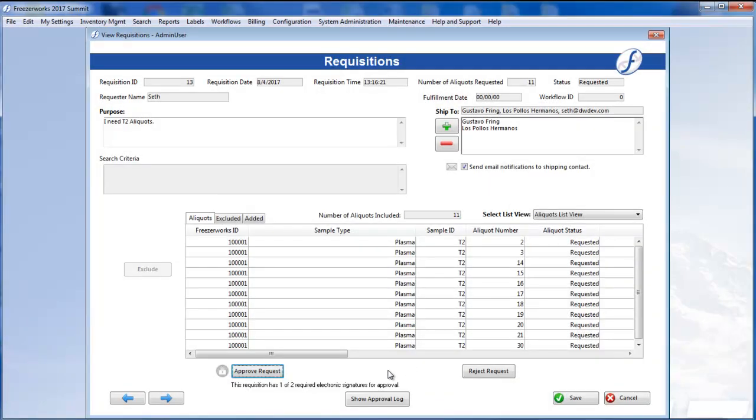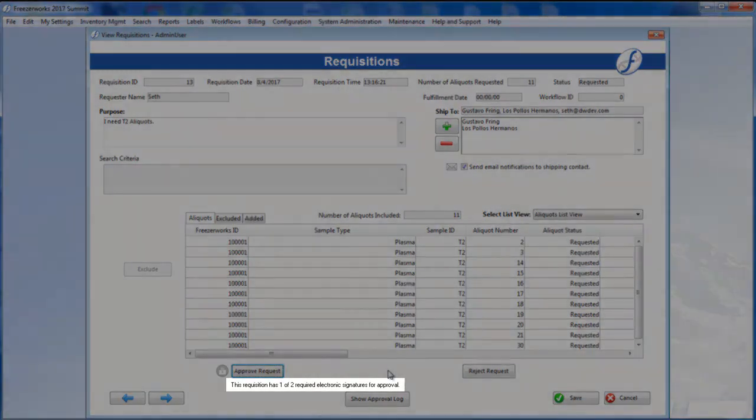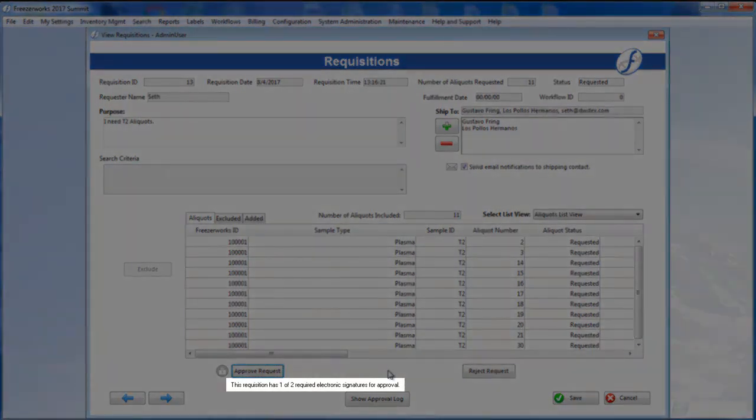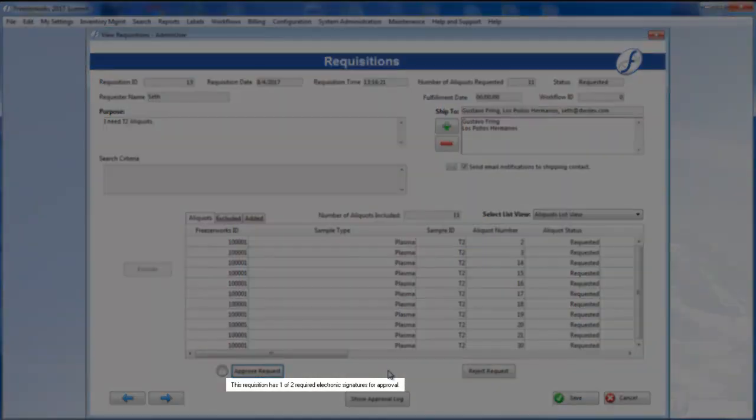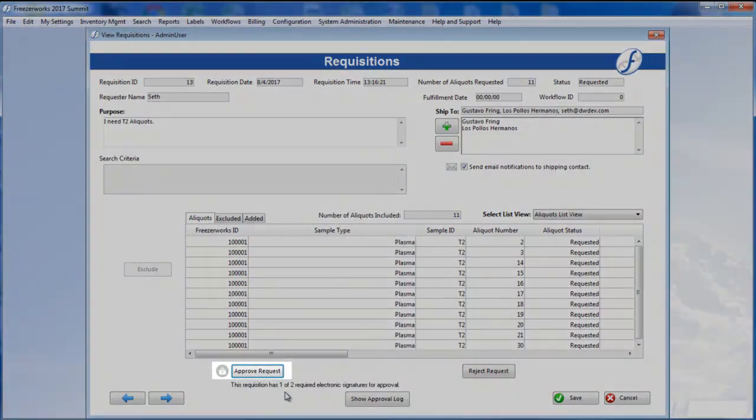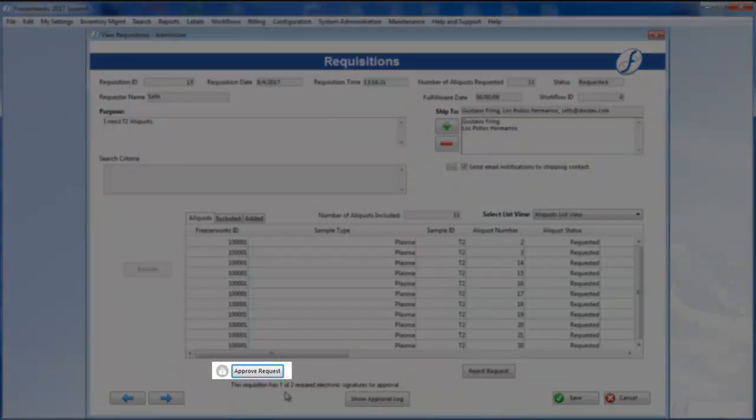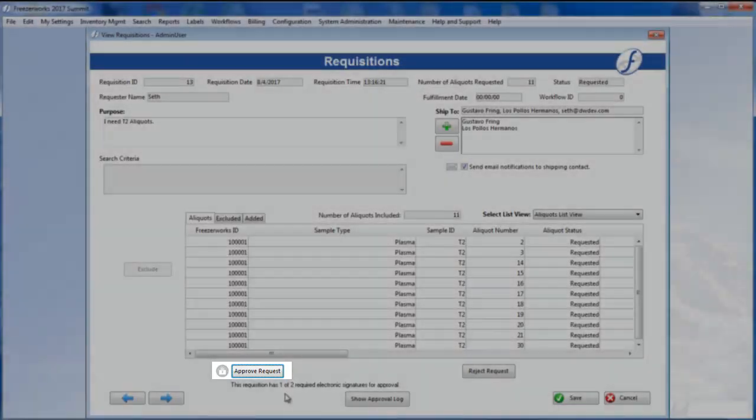Upon returning to the requisition form, you'll notice the message underneath Approve Request has changed, indicating one e-signature has been given. And a lock icon now appears to the left as well, indicating that I can no longer edit the aliquot selection.